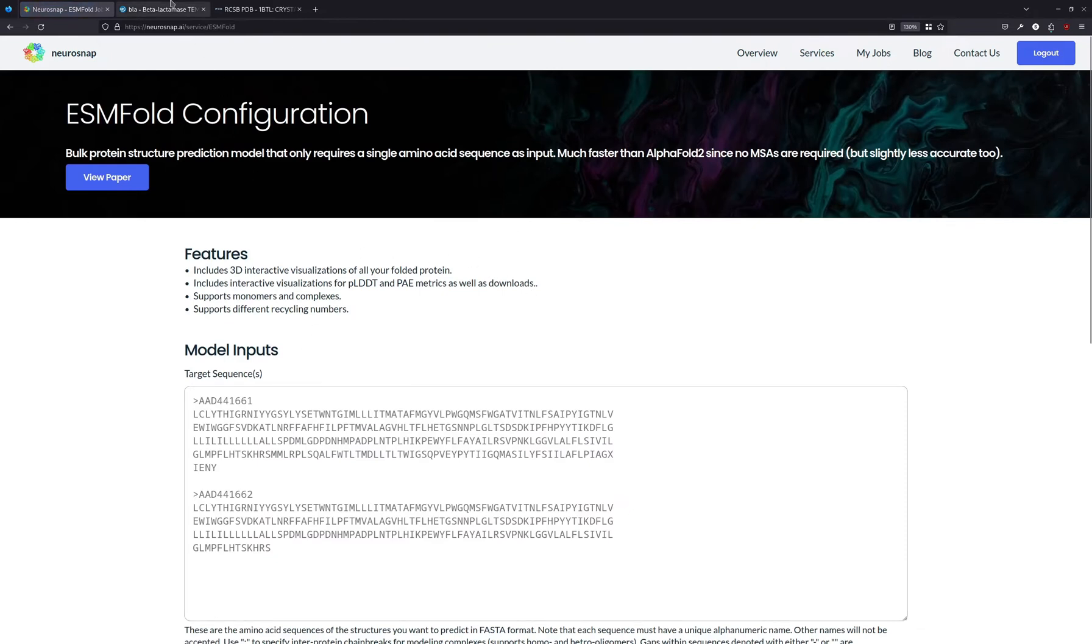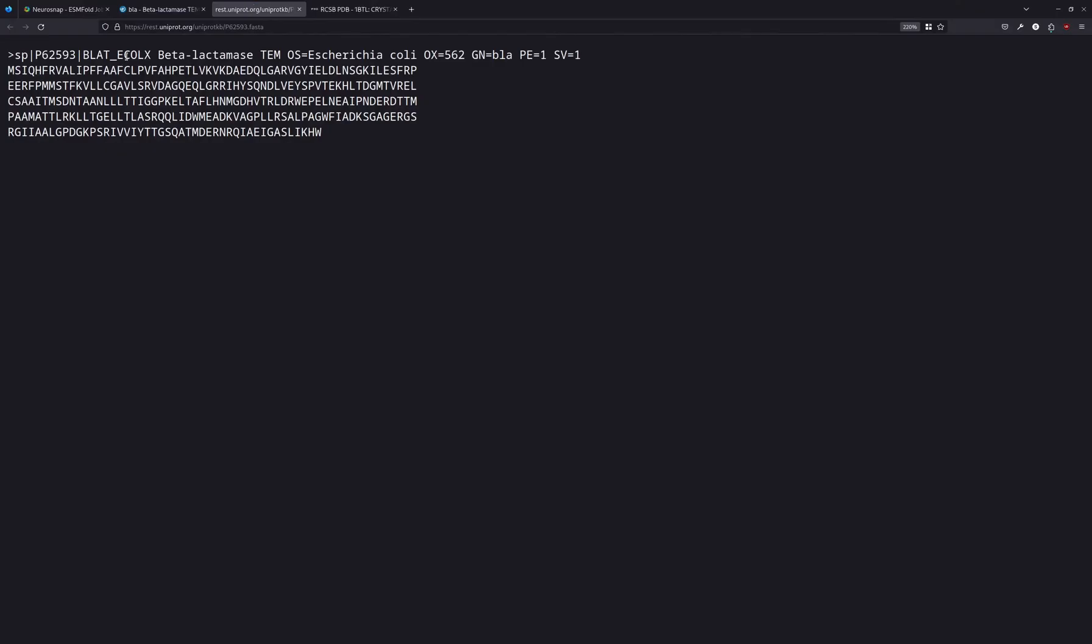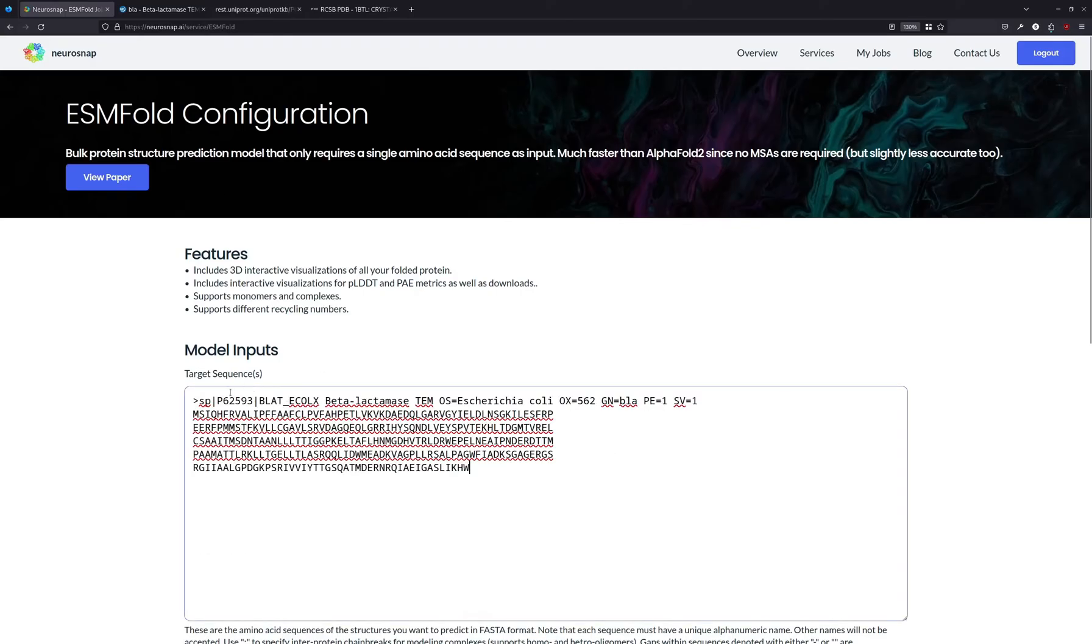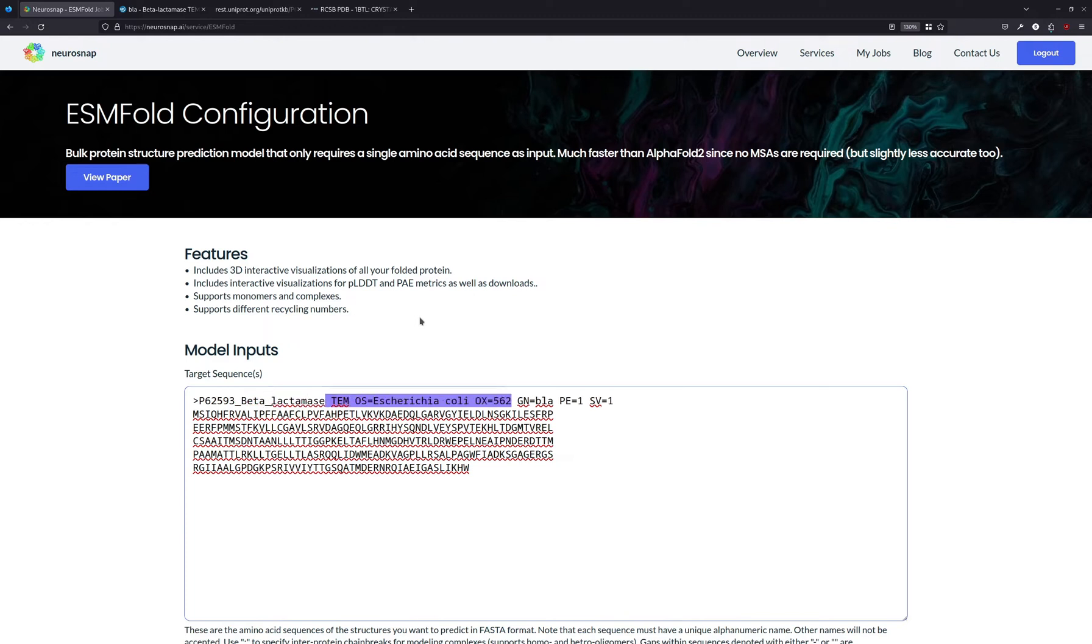What we're going to do is take the amino acid sequence for beta-lactamase and input it over here in the FASTA format. First we're going to remove some of the garbage, as a lot of this is unnecessary. We're going to keep this part though, just for information.